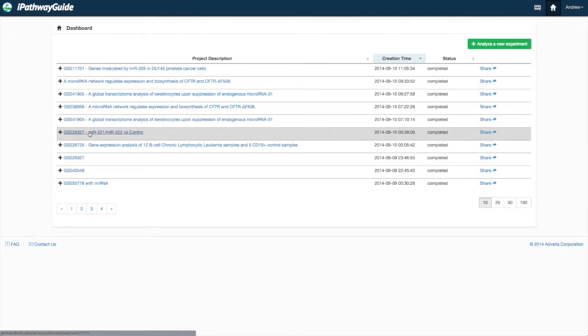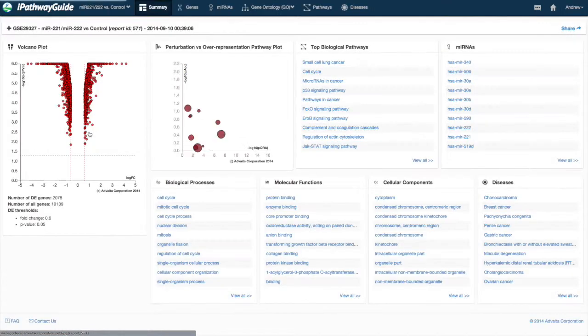From the dashboard, clicking on a completed report will take you to the summary tab for that analysis.